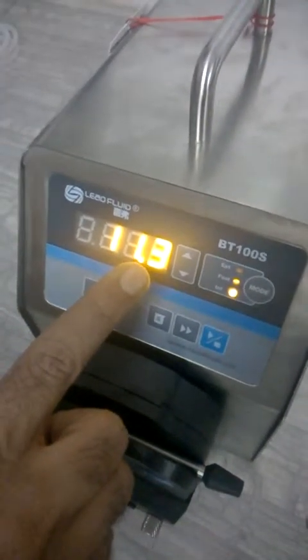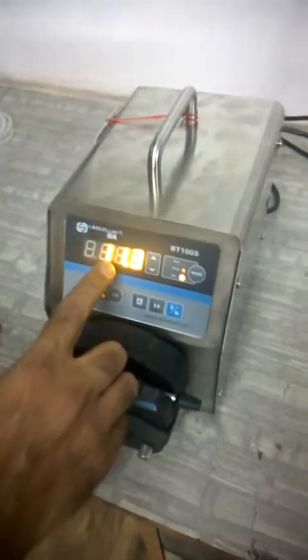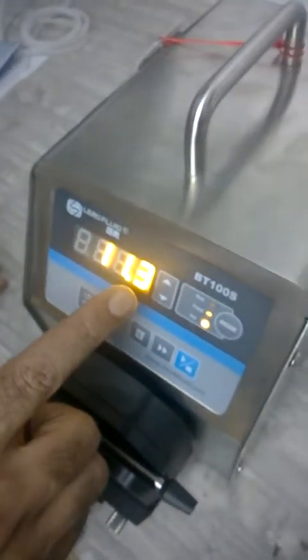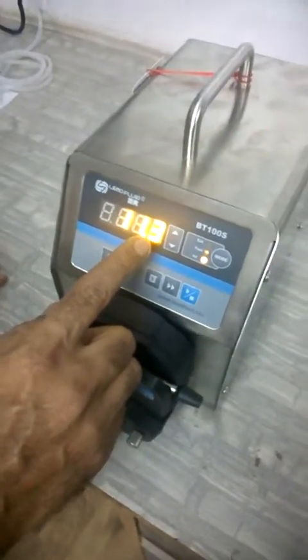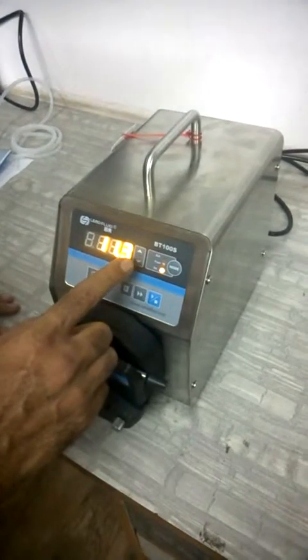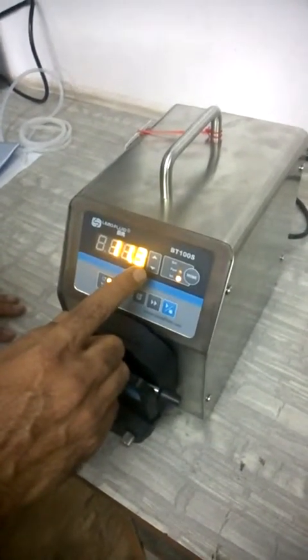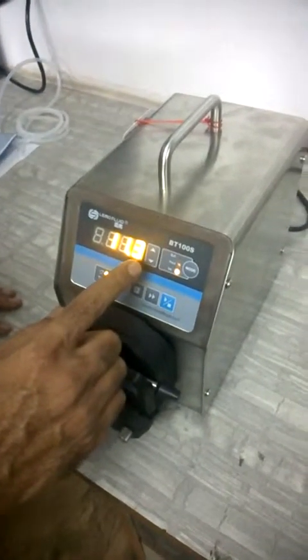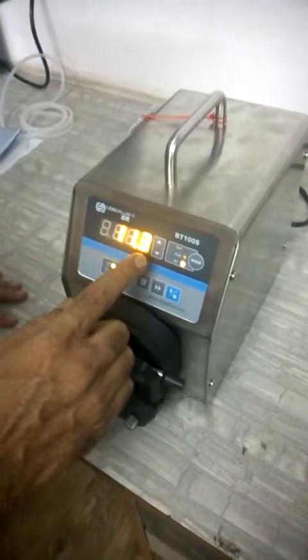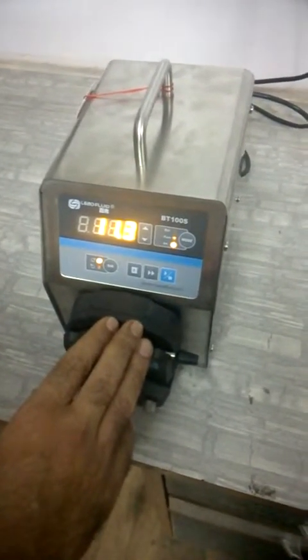In the BT series there are three pump models: BT100S, BT300S, and BT600S. The BT100S speed range is 0.1 to 150 RPM, BT300S is 0.1 to 350 RPM, and BT600S is 0.1 to 600 RPM. Flow rates also differ: BT100S gives 0.00016 to 575 ml/min, BT300S gives 0.006 to 1340 ml/min, and BT600S gives 0.006 to 2300 ml/min.